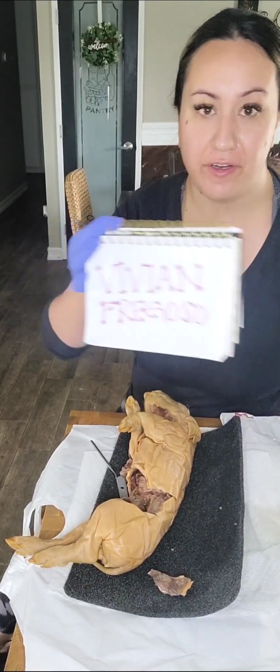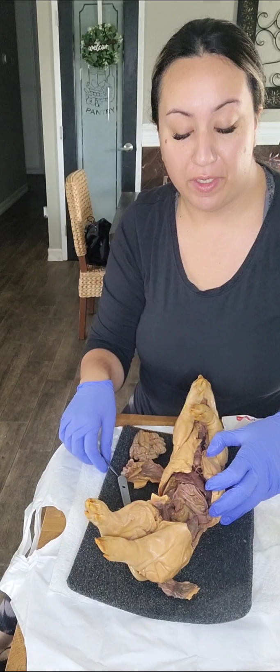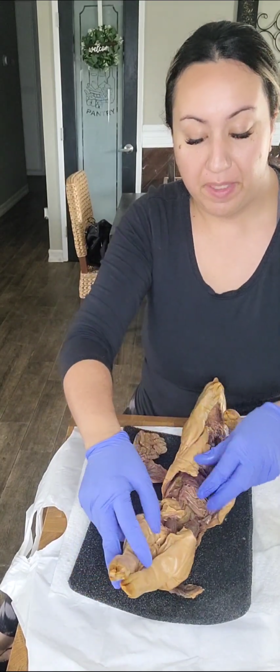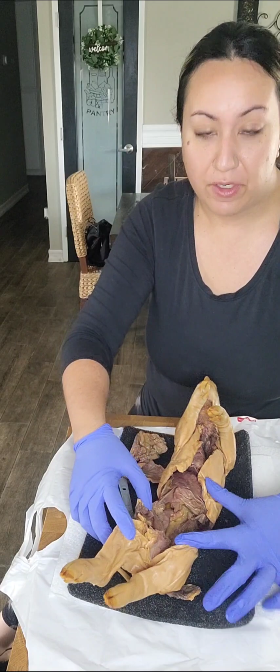So here I have our fetal pig, and I'm going to be going over a few parts of our urinary system for our fetal pig, and then I'll be going over a very common diagnosis that we see that affects our urinary system. So we're going to go ahead and get started. I'm going to try to bring this as close as possible.